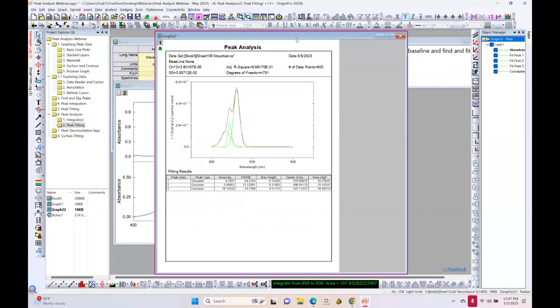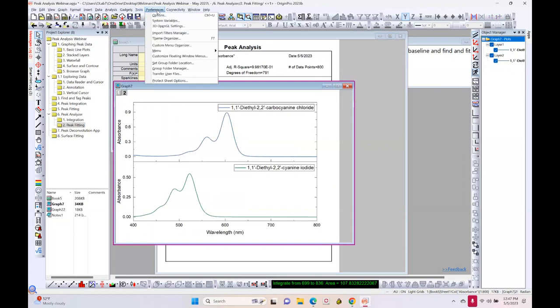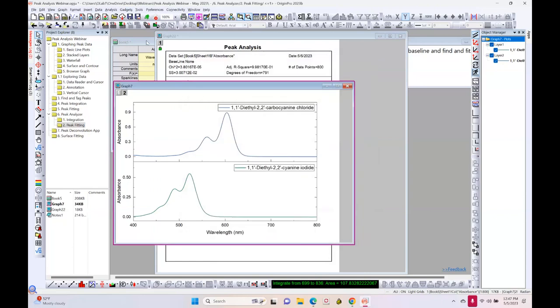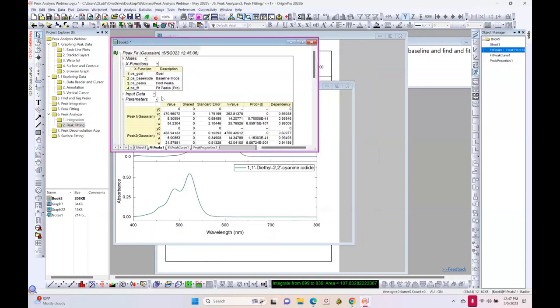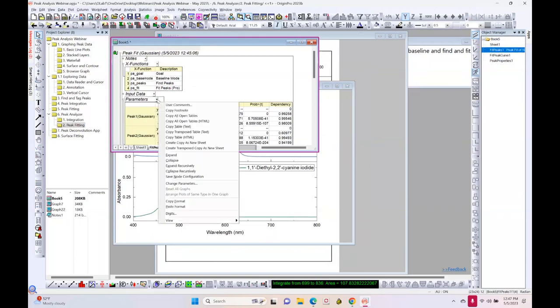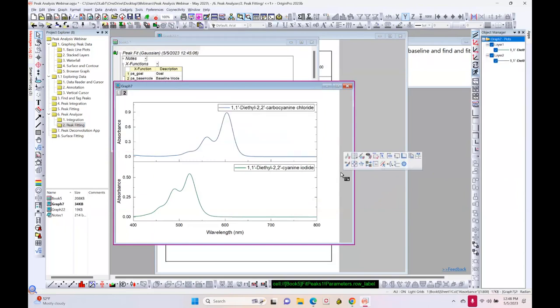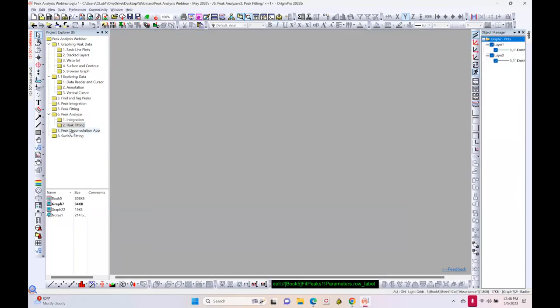Someone is asking: when using peak analyzer, how to control the number of decimal places for peak positions during peak fitting. By default it follows under preferences, options, the numeric format tab where the number of digits defaults to 5 — you can try changing that to a lower value. You can also adjust digits in the report or within the dialog itself. If you still have trouble, send us a ticket and we'll help.